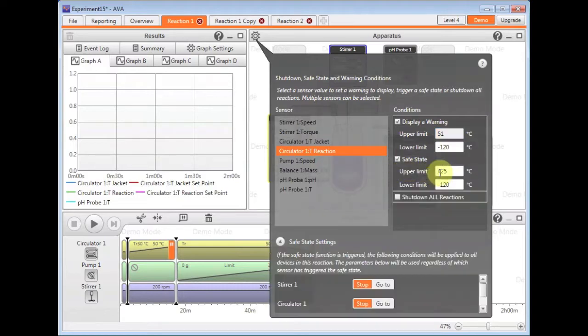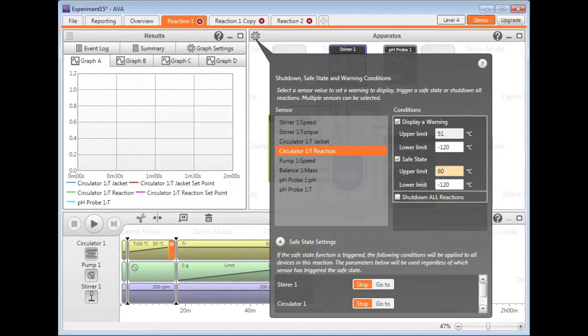You can also have this safe state condition, which is, for example, an emergency set of conditions that you wish to put in place. So if the reaction temperature in this example was to go above 60 degrees, we may wish the stirrer to continue.